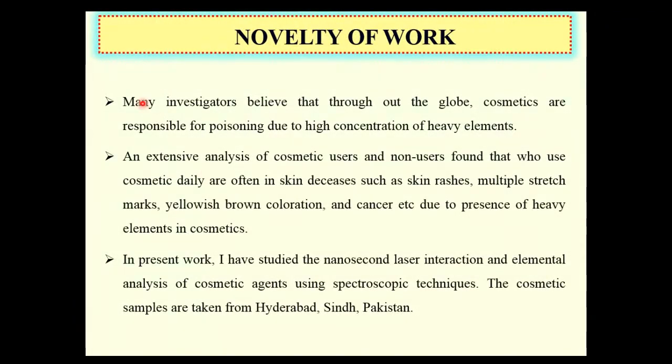Novelty of my work. Many investigators believe that throughout the globe, cosmetics are responsible for poisoning due to high concentration of heavy elements. And extensive analysis of cosmetic users and non-users found that those who use cosmetics daily often suffer from skin diseases like skin rashes, multiple stretch marks, yellowish brown coloration, and cancer etc., due to the presence of heavy elements in the cosmetics. In present work, I have studied the nanosecond laser interaction and elemental analysis of cosmetic agents using spectroscopic techniques. The cosmetic samples are taken from Hyderabad, Sindh, Pakistan.